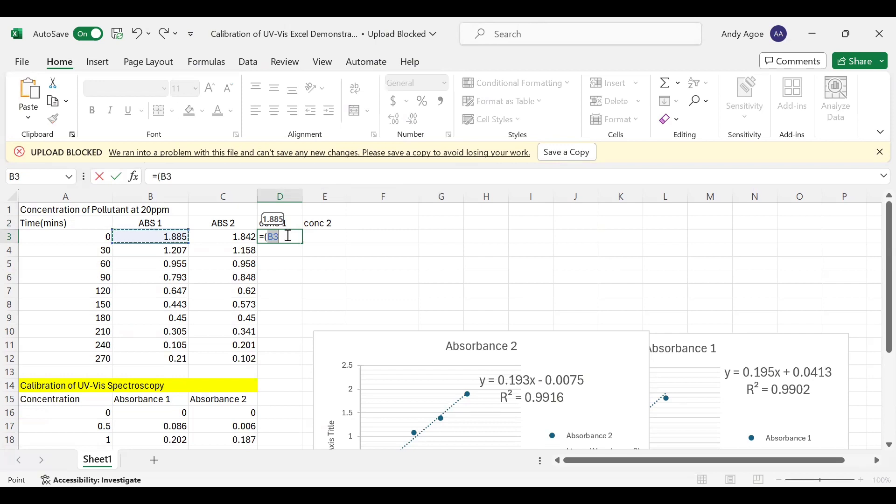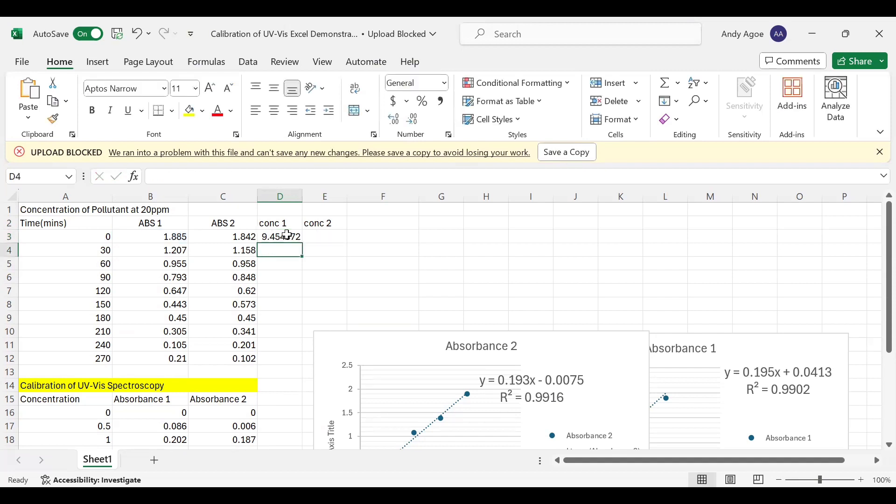So we have Absorbance 1 minus 0.0413, close your bracket, divided by the slope which is 0.195. Then you press Enter. You will see 9.45, which is a concentration around 10 ppm.